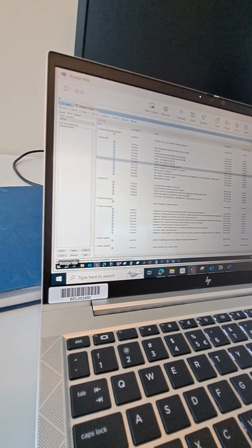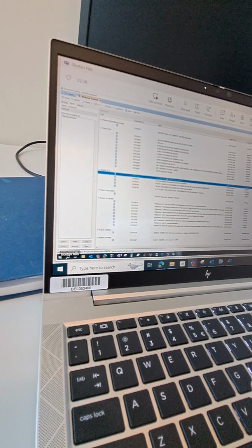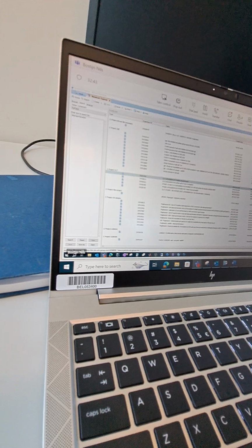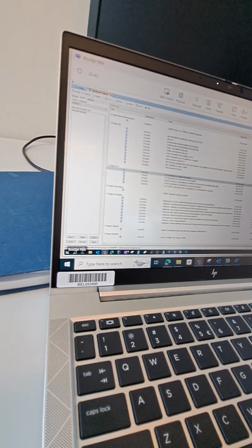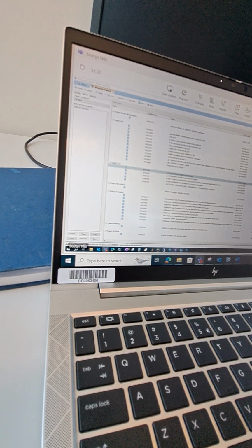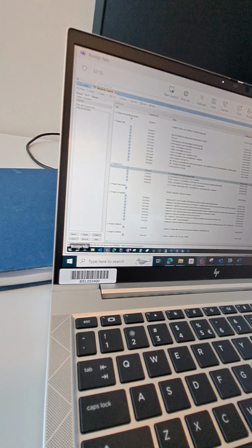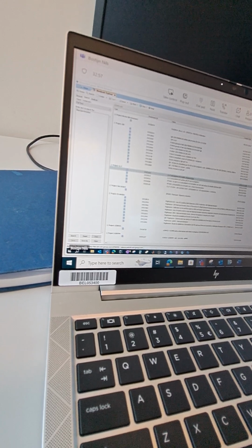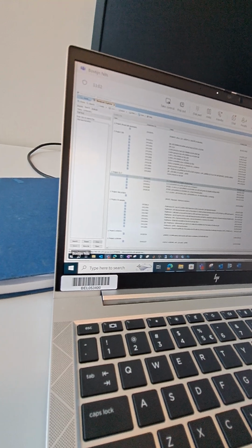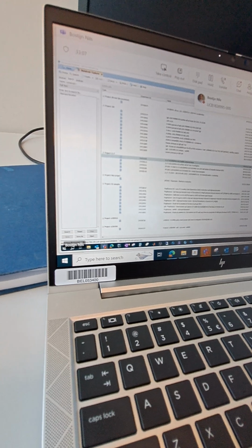But here you see this ELN, the UCB number I just put in the chat. That's a code for the molecule. Then we have a line and then a 3-digit code. The 3-digit code means which form we have, not which crystalline form, but which form. For example, if we have the free base, 8995, it's 000, as in the chat.